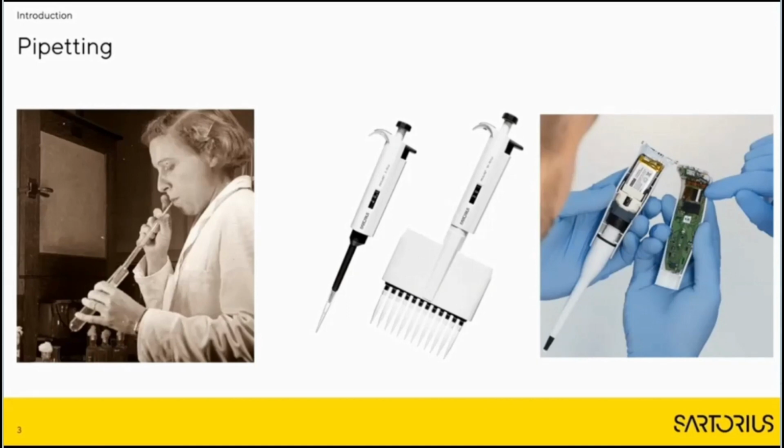And in the late 80s, Biohit, part of Sartorius today, introduced an electronic pipette with a DC motor that really helped and sped up the work. So electronic pipettes have been going strong for around 30 years already, and they are getting more and more popular all the time. And today, as I said, we're going to look at how they will help you and your work.